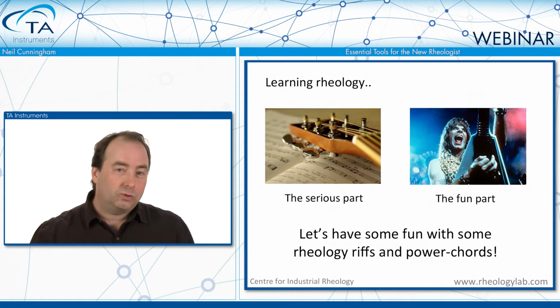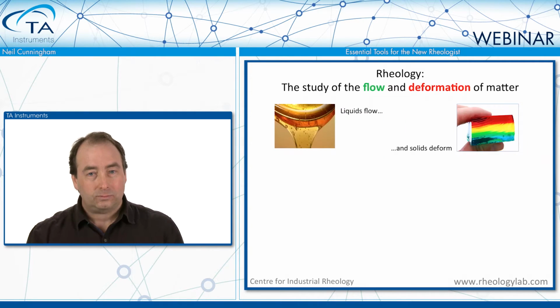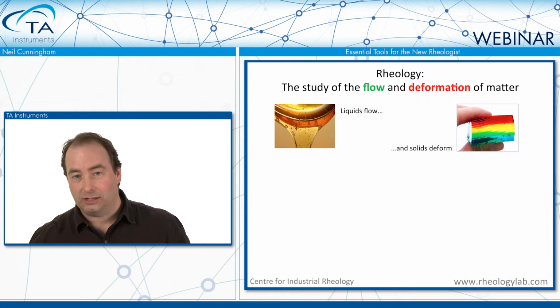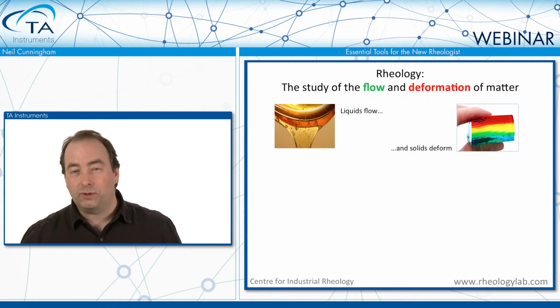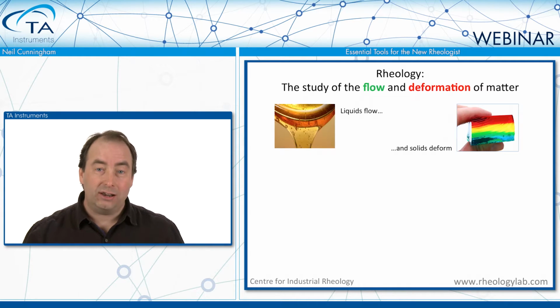Okay, so just to cover some fundamentals here, rheology is defined as the study of the flow and deformation of matter. So flow is a liquid-like characteristic. We often think about rheology as being the study of the flow of fluids, but the deformation aspects are absolutely crucial, and understanding of those deformation aspects is crucial.